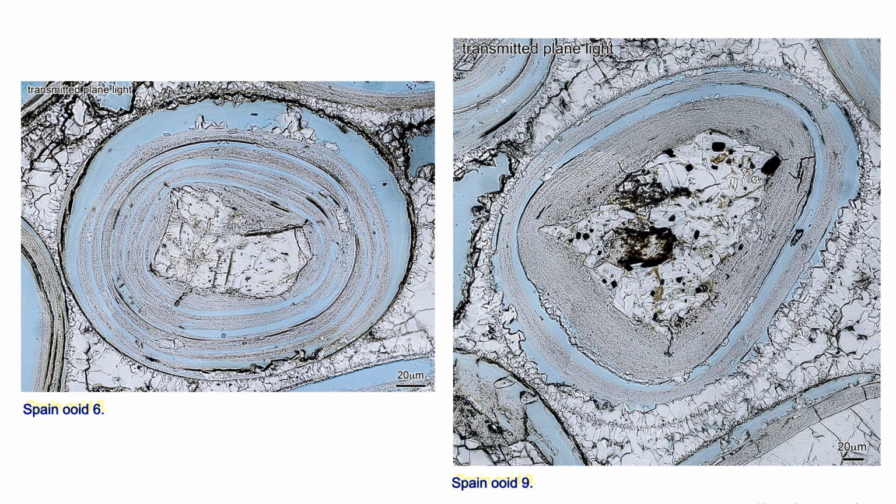The rim of ooid 6 is partly preserved, on the left, by a slither of aragonite cortex, the rest of its rim by intergranular calcite cement. The 5 or so cortex aragonite layers, separated by sheet pores, and ooid 6's nucleus, have fallen away from the top of ooid 6's rim, causing the youngest pore to become crescent-shaped. This cortex pore is the first described so far to contain intergranular calcite cement.